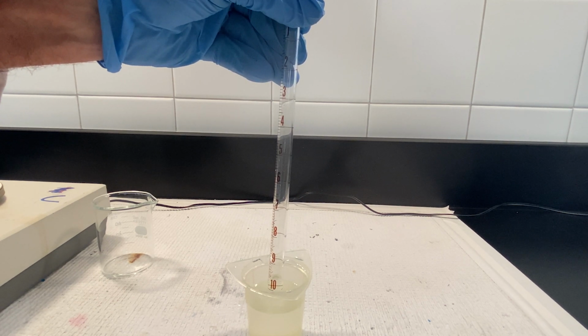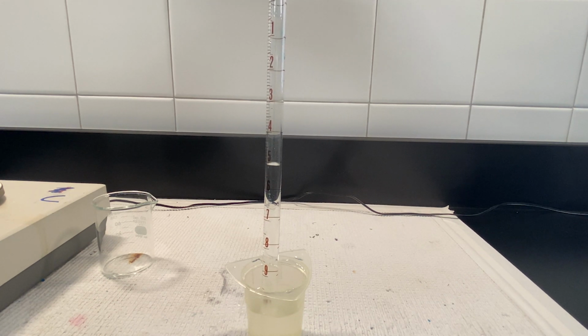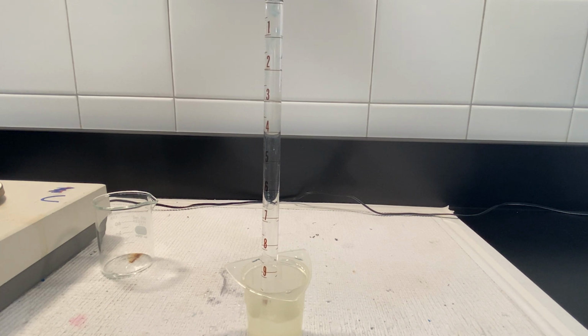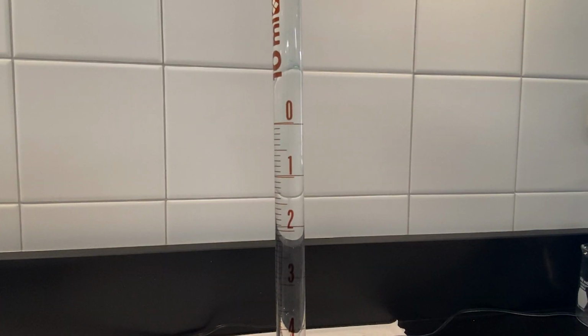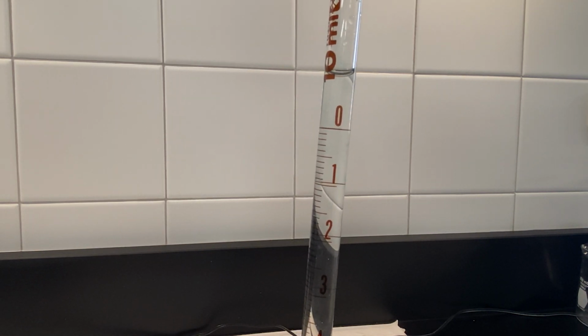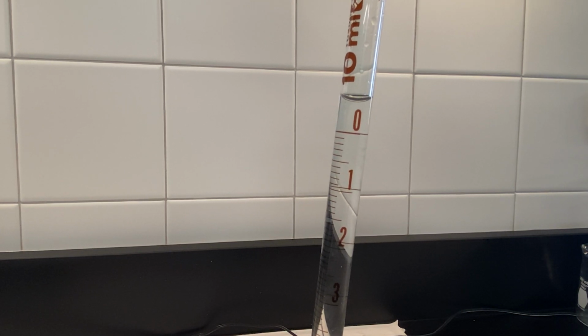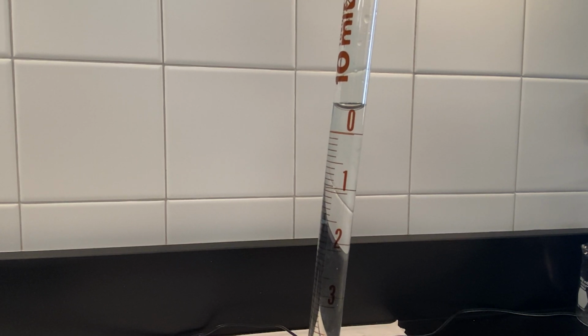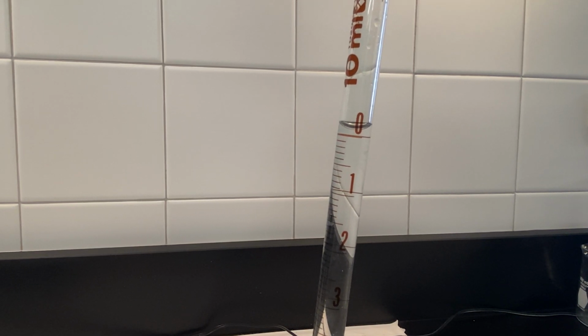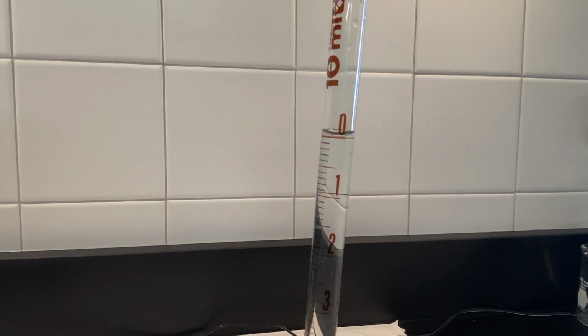With a Mohr pipette, the visual volume actually requires two observations: the liquid level after you dispense the liquid from the Mohr pipette, and the initial liquid that you have. Remember, a Mohr pipette reports how many milliliters you deliver. So at first, your number is going to be very close to 0, if not right on it. And at the end, it's going to be very near 10.